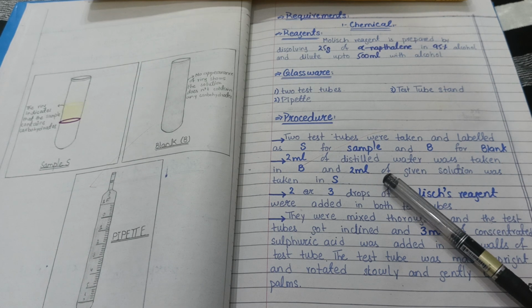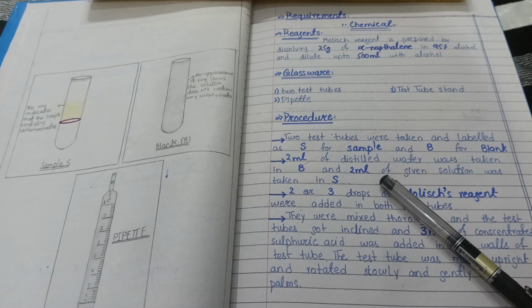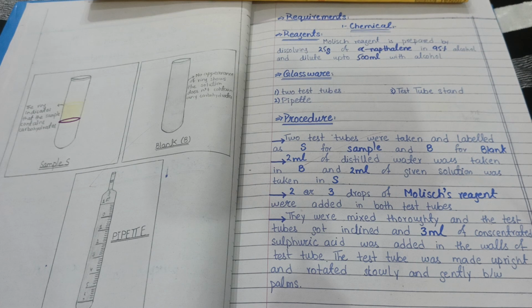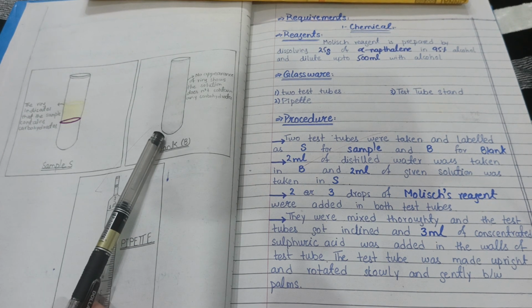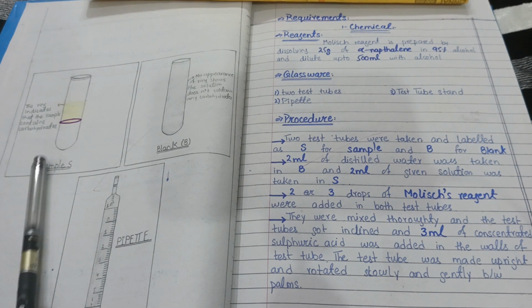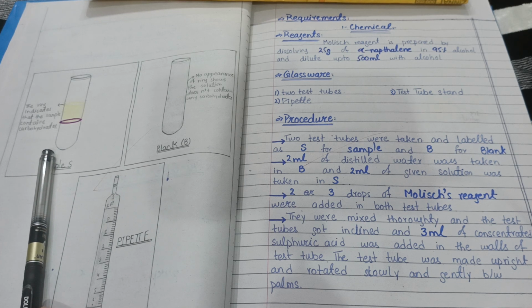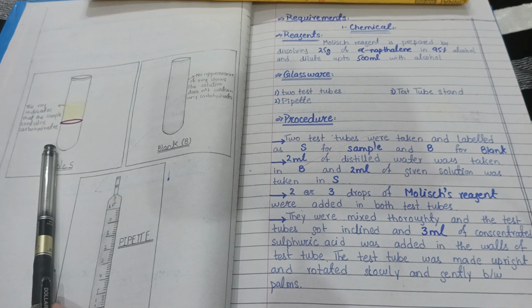Now you have to add 2 ml of distilled water to the B test tube. For example, this is the B test tube and it has just distilled water in it. And this is the S test tube, the sample test tube, and you are going to add some carbohydrate sample which will be given to you in this test tube.